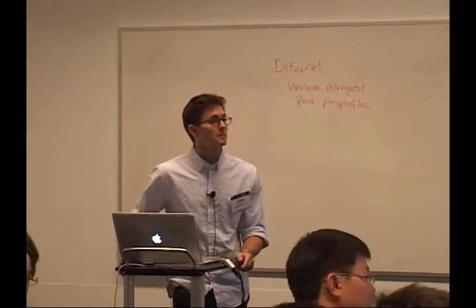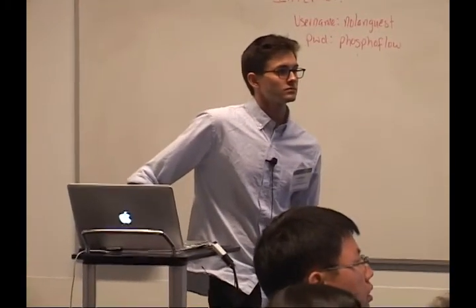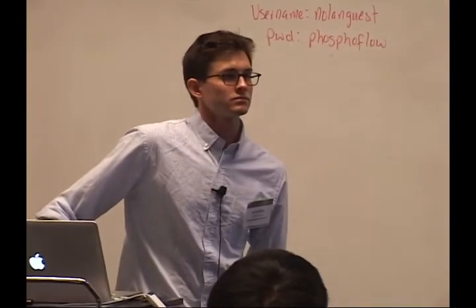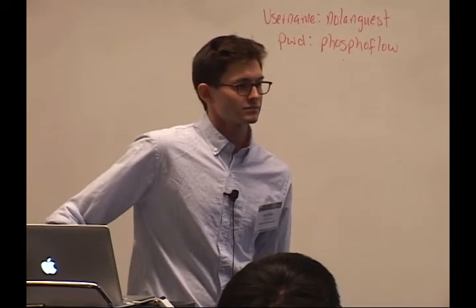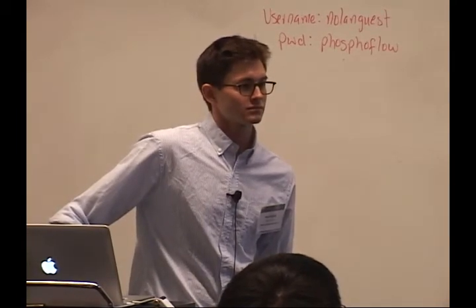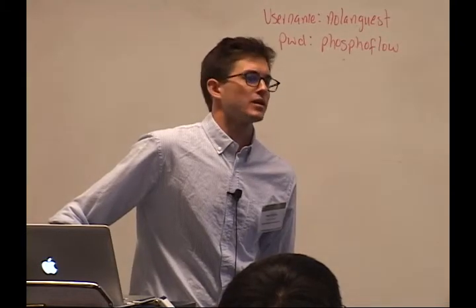Is there a way to measure the range and distribution of the number of molecules when you conjugate the antibody? Since theoretically then you could actually work back to an absolute number of phosphorylation events or binding. You mean the number of metal atoms per antibody?